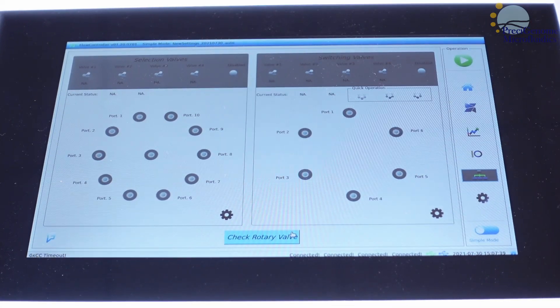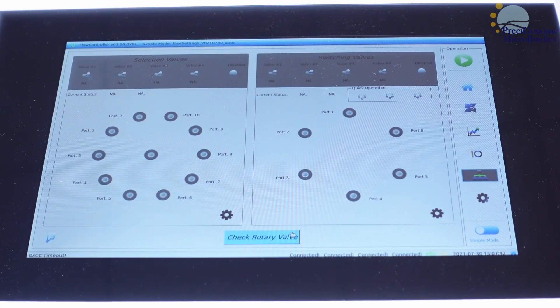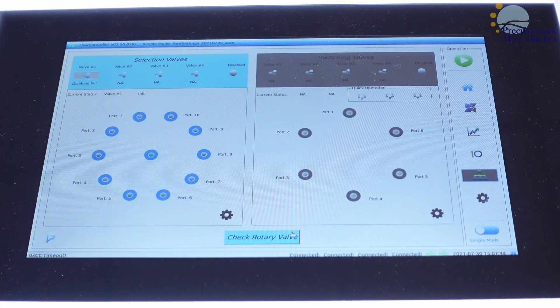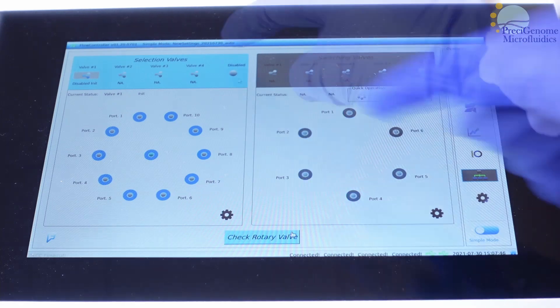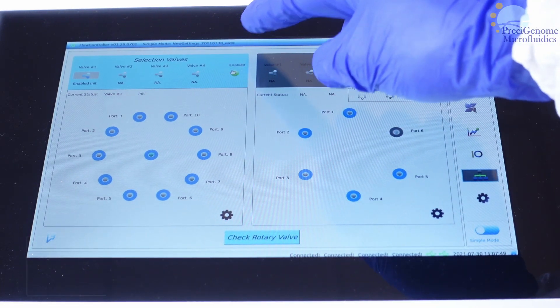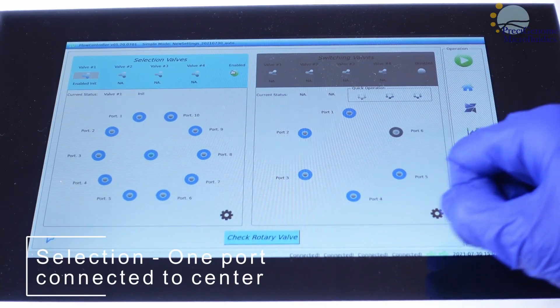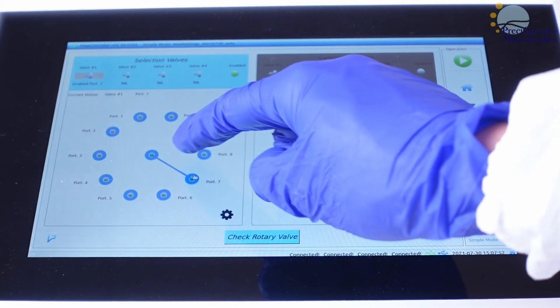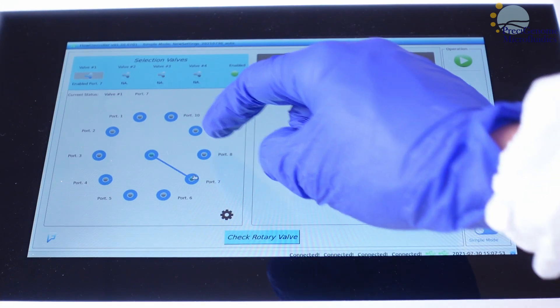For selection valve, this menu also lets us choose which port is connected to the center.